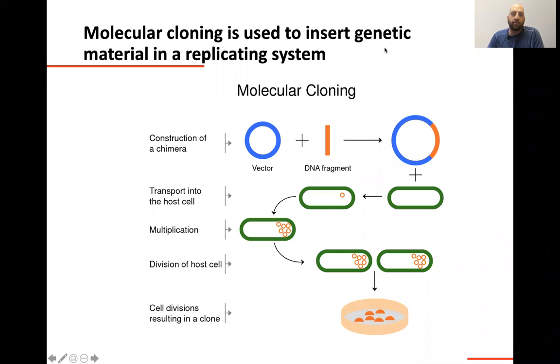All right, at the top of this week, I wanted to spend a minute or two talking about molecular cloning. This is related to the material that you'll be working on in lab. The idea is that we're taking the plasmids that we made before spring break, and we are transforming those plasmids, putting them into bacteria. So I wanted to talk a little bit about that process.